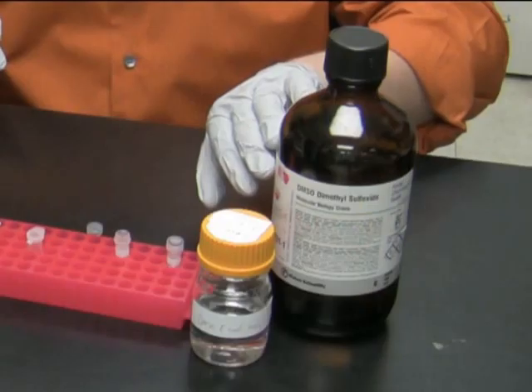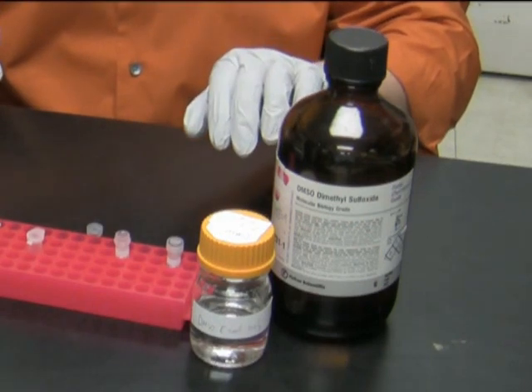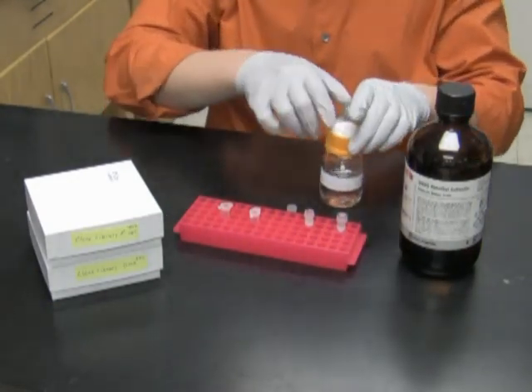In addition I will put 100 microliters of dimethyl sulfoxide, or DMSO, which will serve as cryoprotectant for the E. coli cells. Here is the original DMSO bottle and here is an aliquot that I use on an everyday basis.